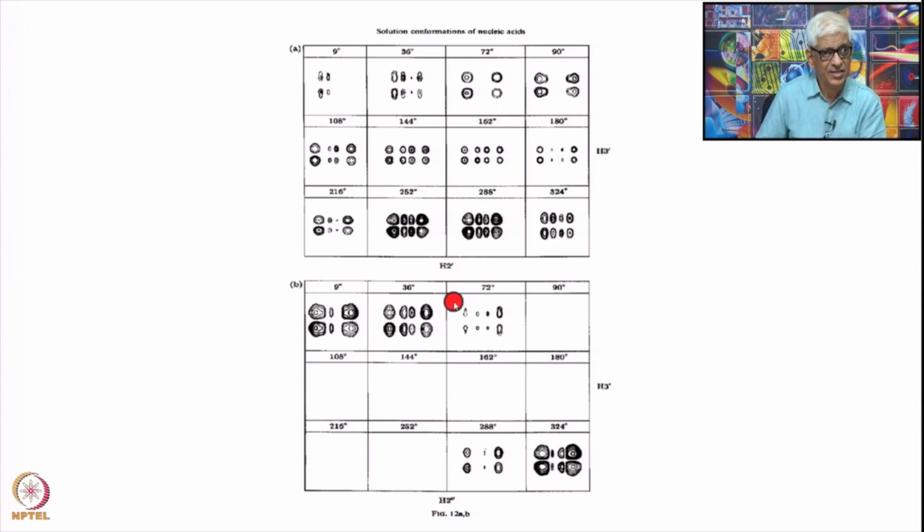Now these are for the COSY 90, not for the COSY 45, and in this case all the components are present; we will not calculate this fine structure. It can be calculated in the same way as I indicated for the 1' 2' and the 1' to double prime cross peaks, taking the splitting patterns of the individual protons and combining them with the splittings of the other ones, you will calculate the structures here. You see there are many cancellations depending upon the sugar geometry, and you will have different kinds of fine structures here. So one has to simulate these, and all the peak patterns have to match at the same time. Once you choose a certain set of coupling constants, you must not only match the 1' 2' and 1' to double prime, but must also match the 2' 3' and 2" 3' fine structures. Only then can you be confident that your coupling constant calculations are correct.